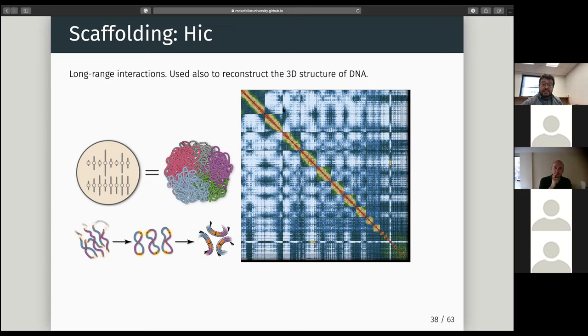So here is a plot of Hi-C. Off the diagonal, this is all the trans interactions, meaning that that's the biology acting. In the diagonal is where you'll have the same chromosome, reads originating from the same chromosome, interacting with each other. So you can identify chromosomes here. Now you can use this information to scaffold contigs together, right? You're going to map all your reads of the junctions onto the contigs. And because you know these reads are connected, you'll be able to order and put together the different parts of the genome.